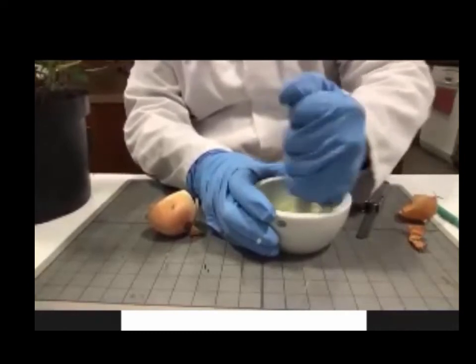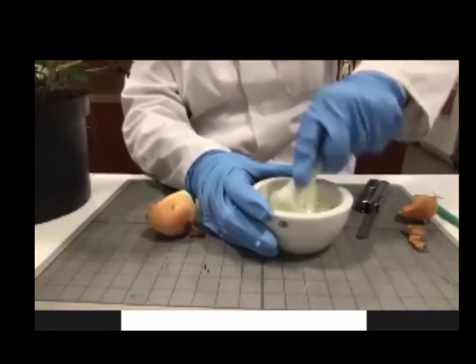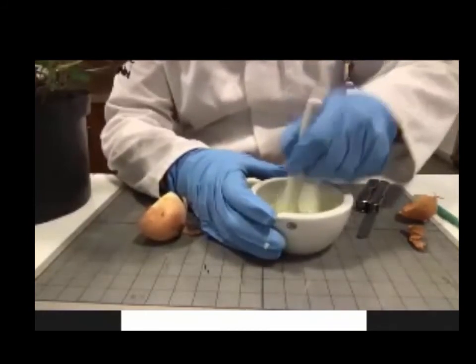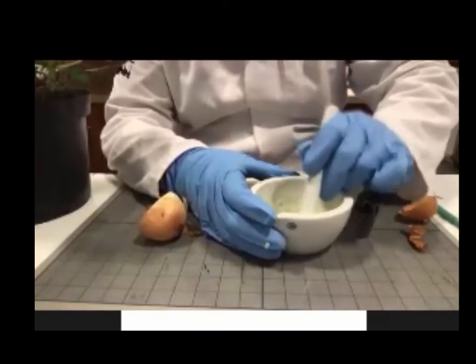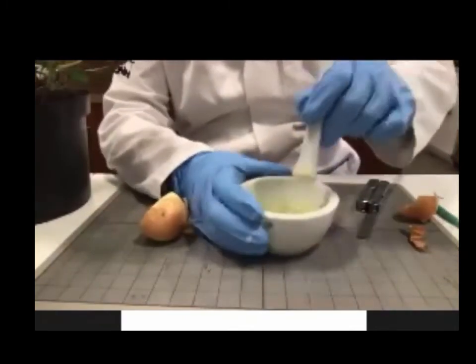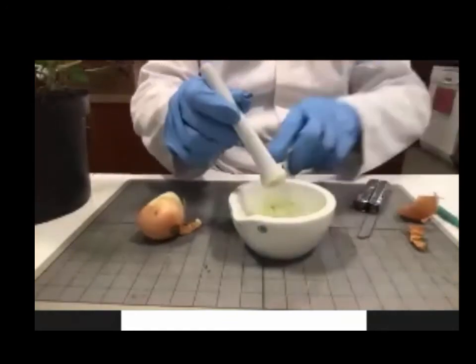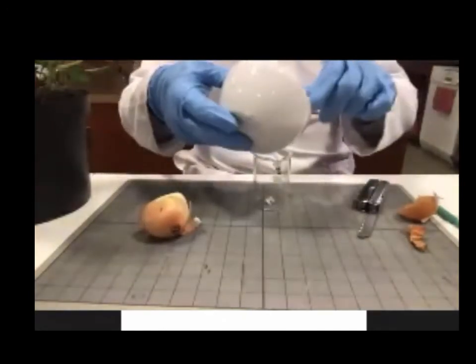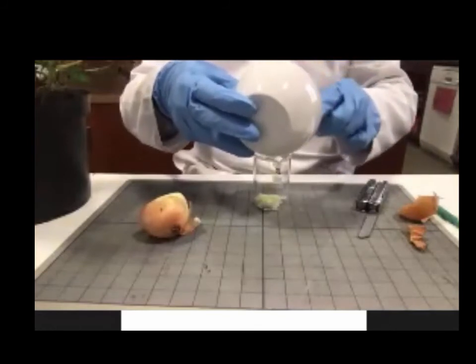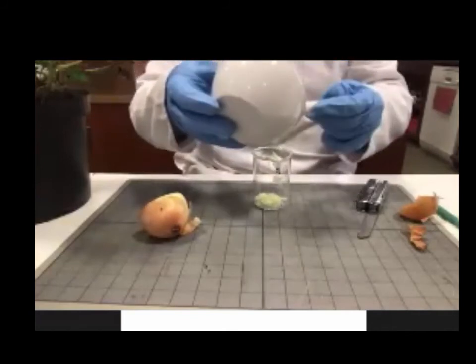The minute you do this, you're amazed to see how much liquid suddenly appears. Okay, so question number one is, what does the salt do? It relates to where the liquid is coming from. Okay, good. I'm just putting that into a small beaker. Your test tube, it doesn't matter.